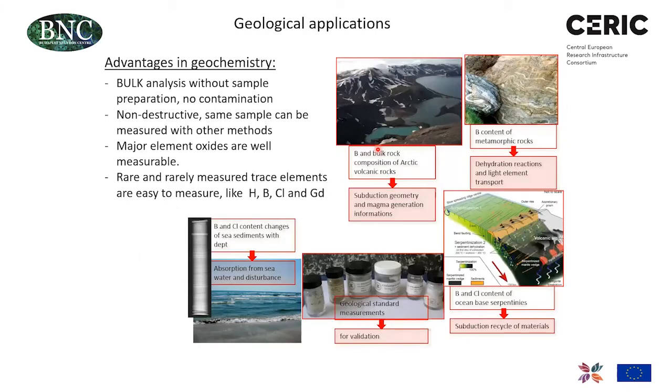In geochemistry, bulk analytical capability is very useful, because we can measure either powdered samples or whole rock samples without any sample preparation and digestion, and without the risk of any sample contamination. And as it is non-destructive, the sample can be measured with other techniques in a subsequent measurement, and all the required and relevant elements can be measured.